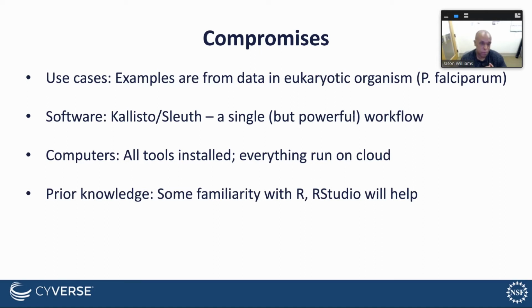So that's great. We're also doing everything really on the Cyverse platform. So there's no tools to install. Everything is running on the cloud. And I think, and I hope that as biologists, we're getting more comfortable with that, because often we're working with large data sets that we cannot manage on a computer. In terms of prior knowledge, as we get towards the end, when we do the visualization and play around with some of the data, being familiar with R will be helpful there in RStudio. But if you don't know those things, it's not that you won't be able to follow along, but you probably will need to get a little bit more familiar before you make lots of changes on your own.